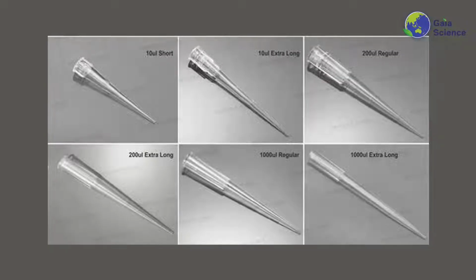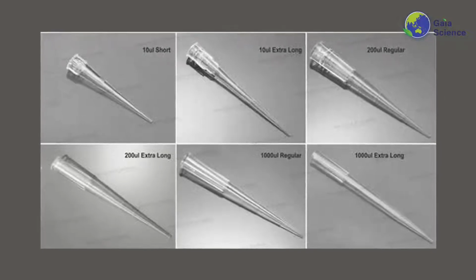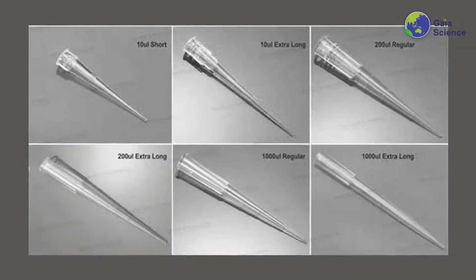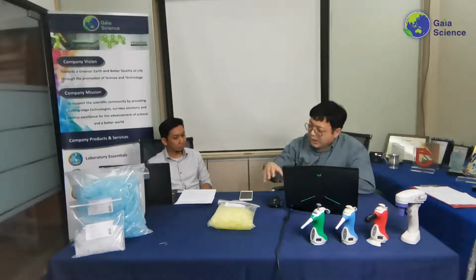I think they call it maximum recovery as well, if I'm not mistaken, but I think that might be for a different purpose. We'll talk about it in a short while. But generally speaking, yes, there are long and there are short tips. So again, this is really a case by case basis. Generally speaking, the ones you see over here are all short.